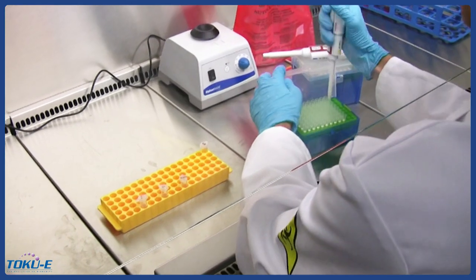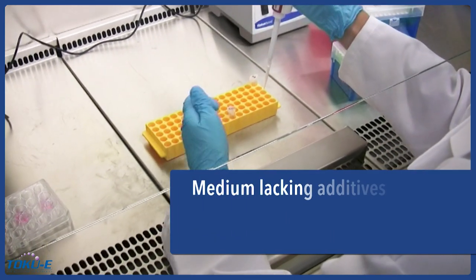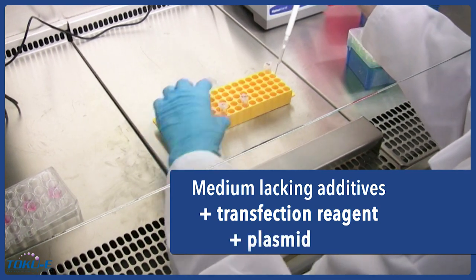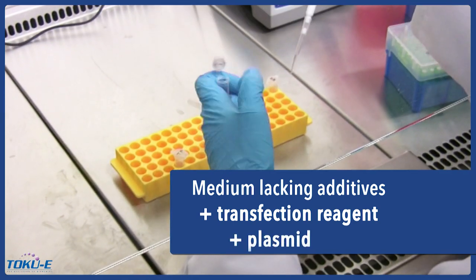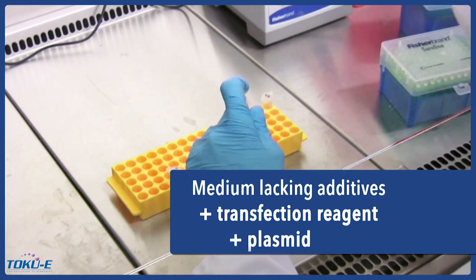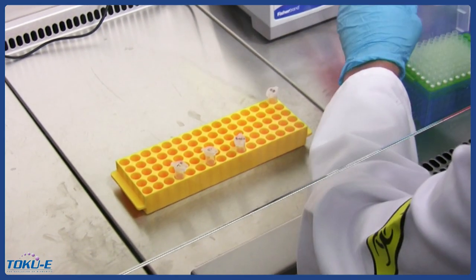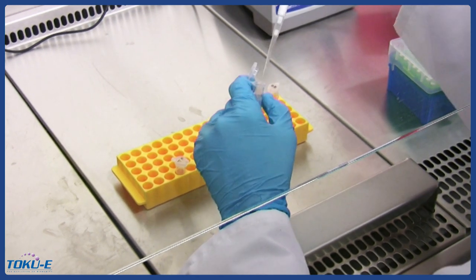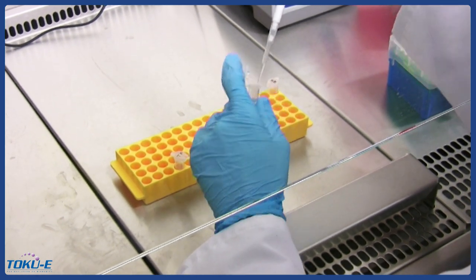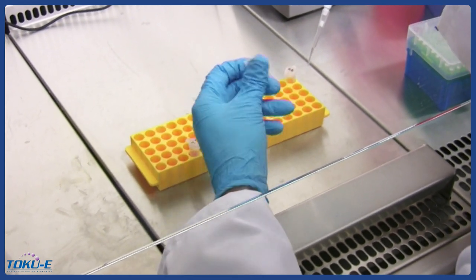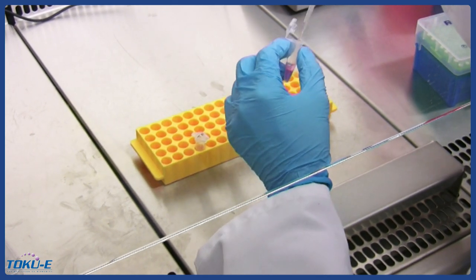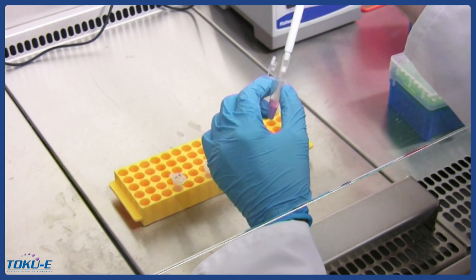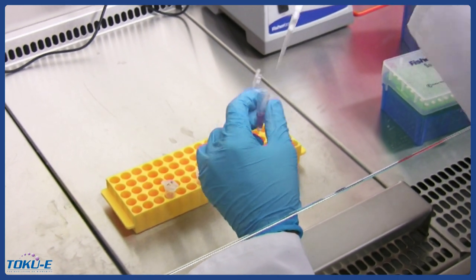Generally speaking, the transfection step involves simply mixing medium lacking additives with the transfection reagent and plasmid, incubating the mixture, and adding it to the non-transfected cells. The protocol obtained from the transfection reagent of your choice will specify these parameters. The protocol we obtained from this transfection reagent manufacturer calls for mixing the medium lacking additives with the transfection reagent and plasmid by pipetting up and down.